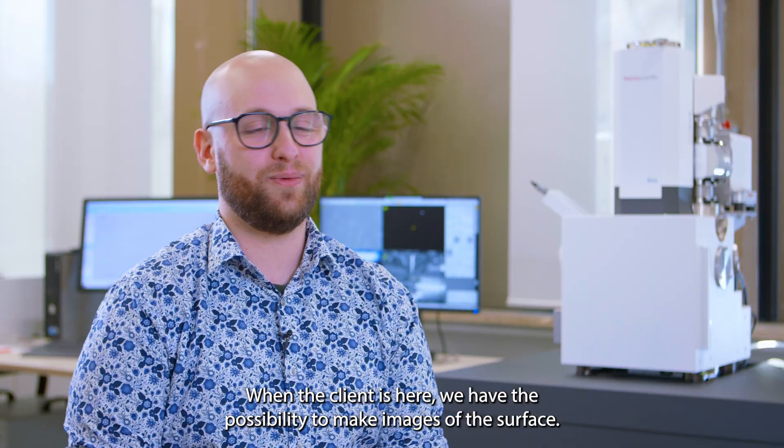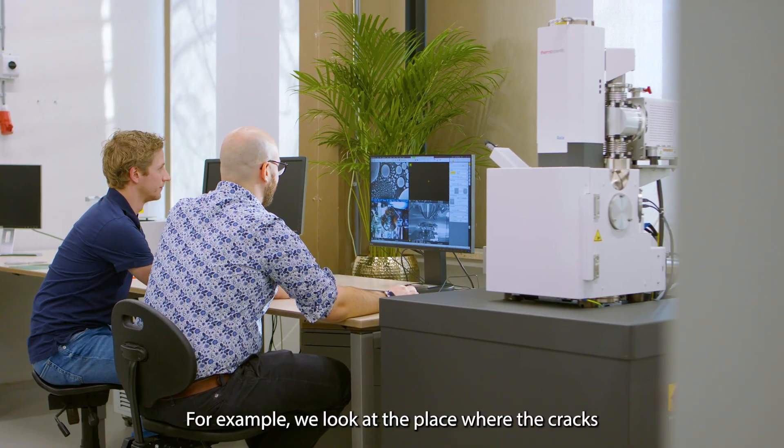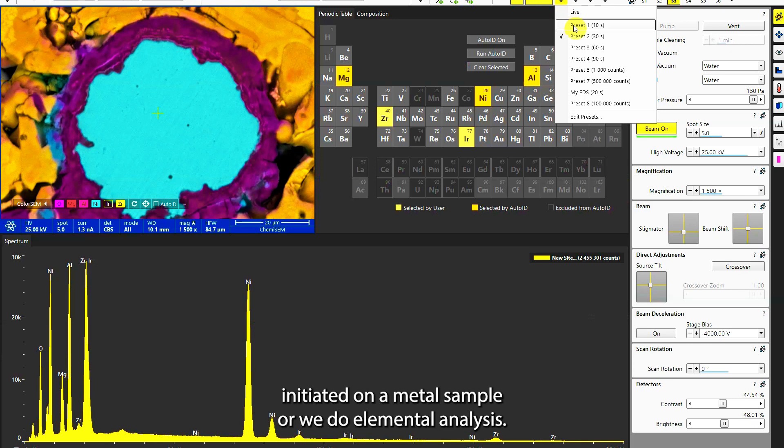When the client is here, we have the possibility to make images of the surface — for example, we look at the place where the cracks initiated on a metal sample, or we do elemental analysis.